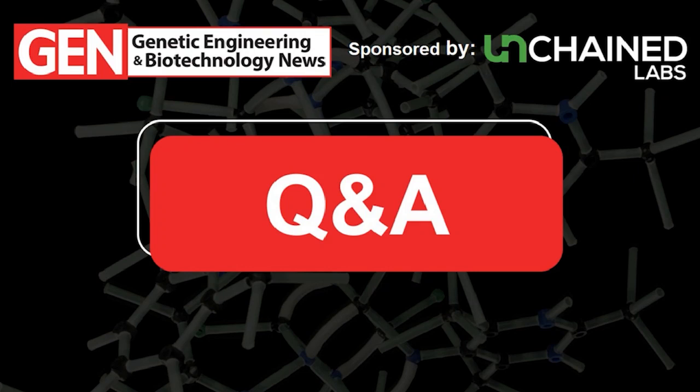All right, and another question for you, Kevin. What limitations does Stunner have? Is it possible to measure in-process samples? Okay, so for Stunner, what you're going to want to do is have a sample that's above the titer of about 1E12 Vg per mil. So that usually puts you somewhere in the downstream processing environment.